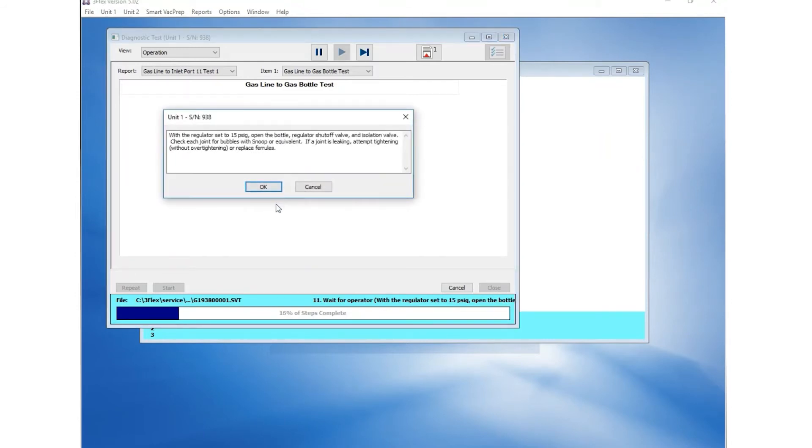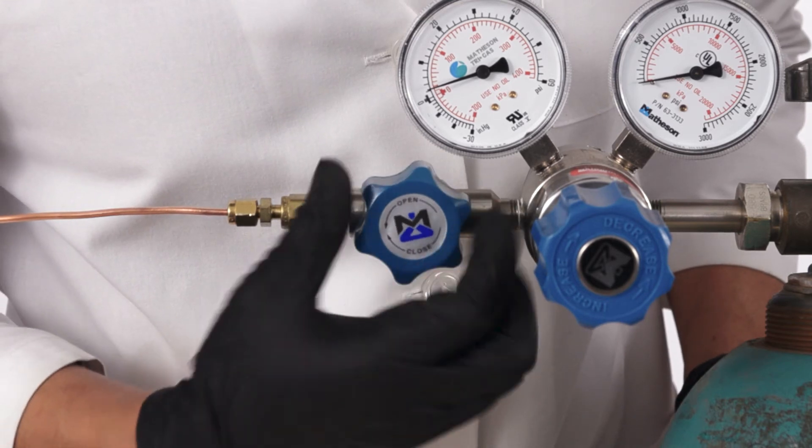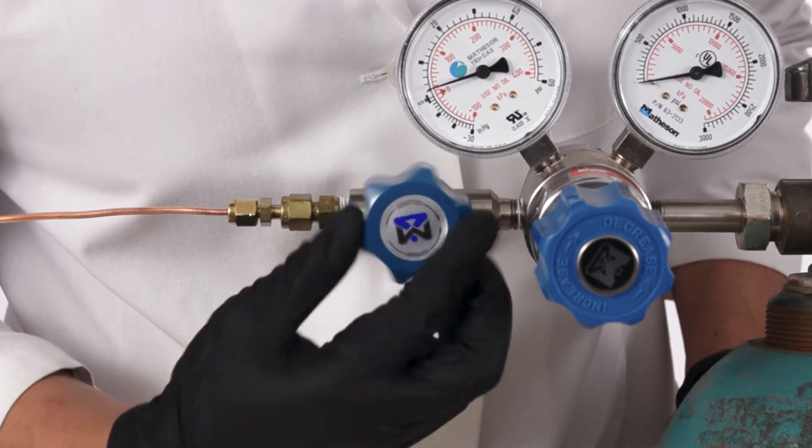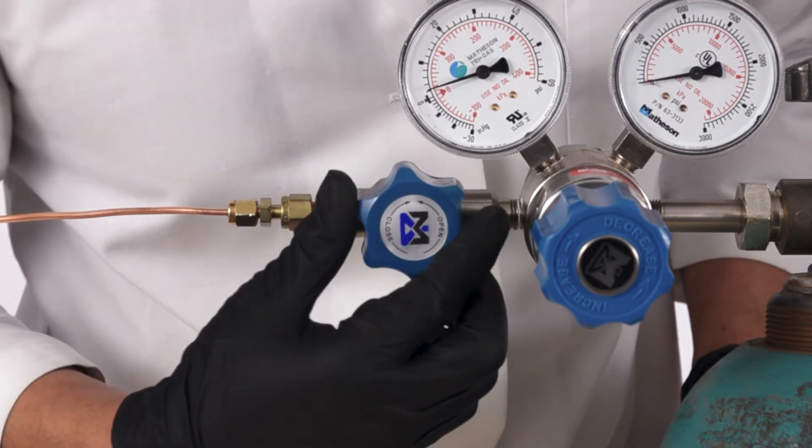The third prompt will summarize the manual leak check using SNOOP or equivalent, tightening the connections and setting the regulator to 15 PSIG. We will perform the leak check now before moving to the next prompt.